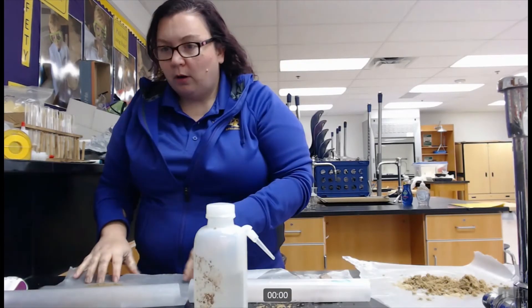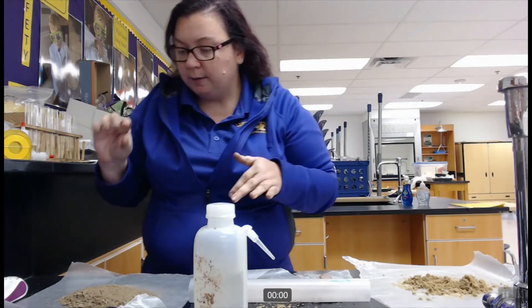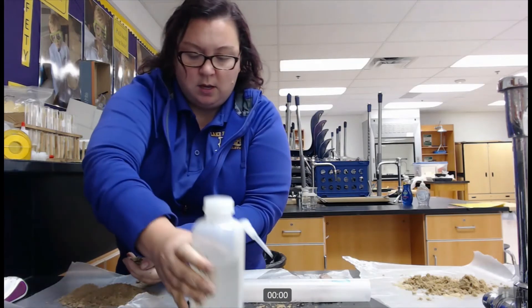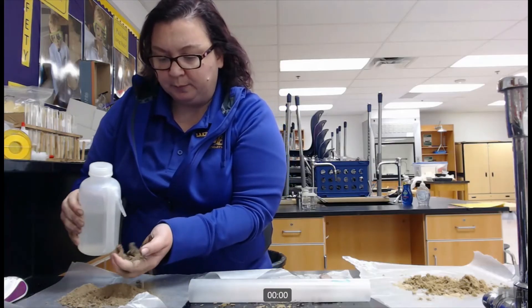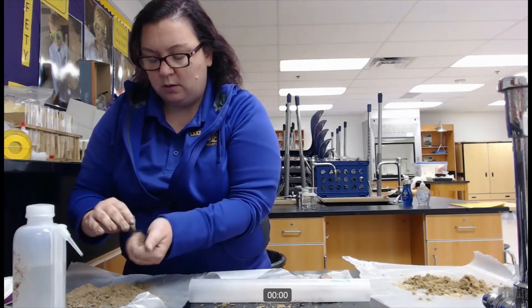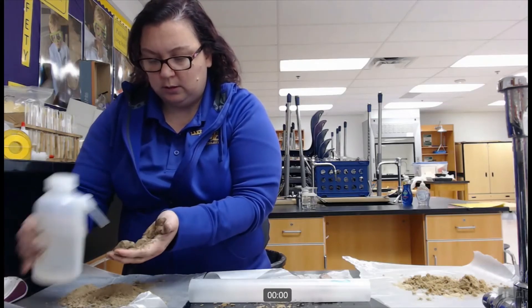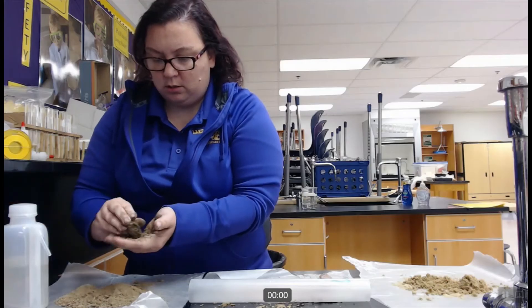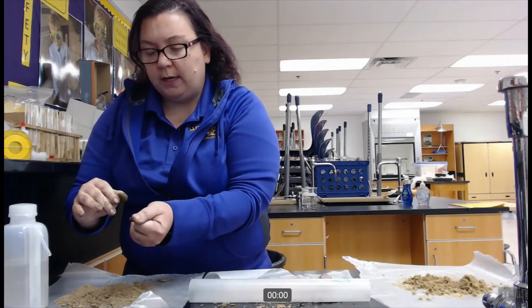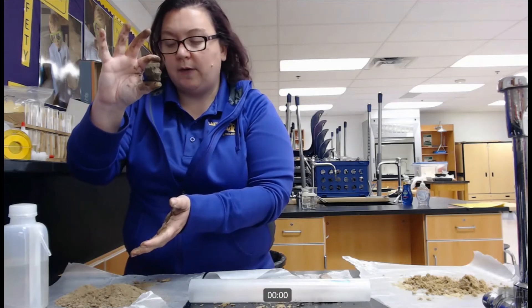With our third sample, again I have ground it up with the mortar and pestle to get rid of any big chunks, and I'm going to put a sample into my palm — about 25 grams. I am going to moisten it and knead it. When I squeeze it into a ball, we can see that it does in fact hold its shape.